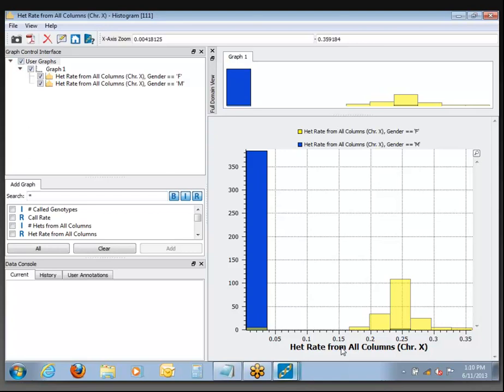Let's move on. Let's look at Part C. This morning I went through the process of reducing SNPs down to an informative set that we could use to run principal components analysis and IBD. We're going to be on Part C: Reducing SNPs to Minimal Informative Subset.